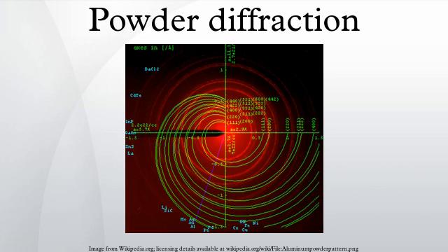Another limitation is that the intensity of traditional generators is relatively low, requiring lengthy exposure times and precluding any time-dependent measurement. The advent of synchrotron sources has drastically changed this picture and caused powder diffraction methods to enter a whole new phase of development. Not only is there a much wider choice of wavelengths available, the high brilliance of the synchrotron radiation makes it possible to observe changes in the pattern during chemical reactions, temperature ramps, changes in pressure and the like. The tunability of the wavelength also makes it possible to observe anomalous scattering effects when the wavelength is chosen close to the absorption edge of one of the elements of the sample.